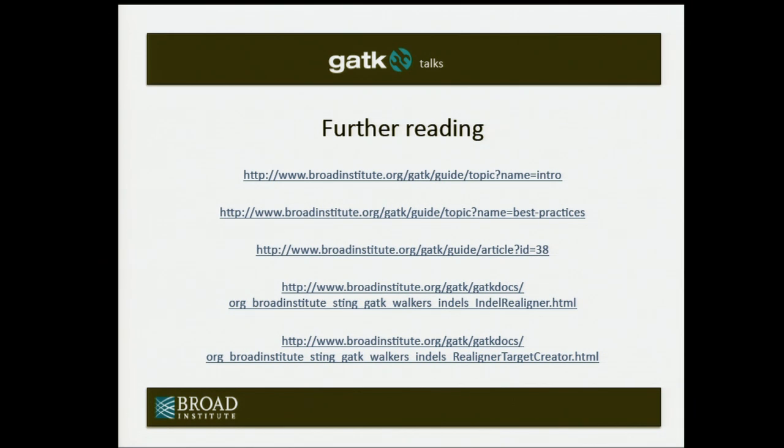For larger events, one could do that, but it turns out to be not as trivial as you think. You really need to know the exact alleles in advance to be able to do this, and usually the breakpoints aren't quite as crisp or clear. There is an aligner that does this. It's Andrew Kirby's. I forget what it's called. He goes back to the unmapped reads and does this realignment. It's very expensive to do that. So if you really can't miss your variant, you have a single target variant, yes, you might want to use his tool, but it's not something we necessarily need to do.